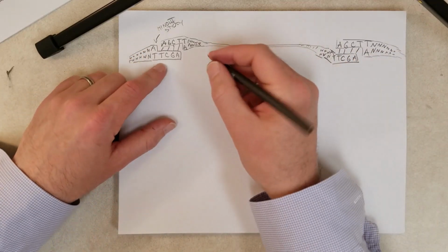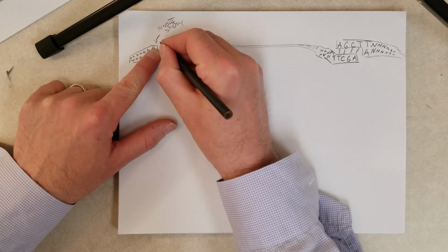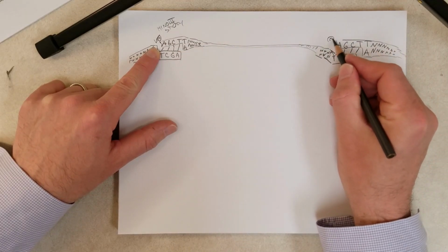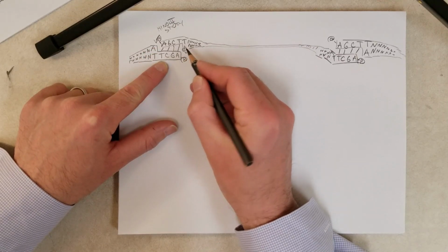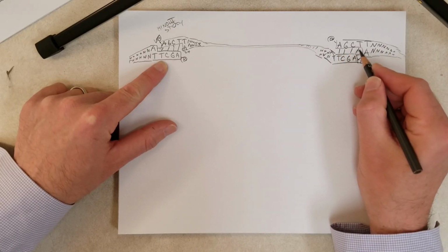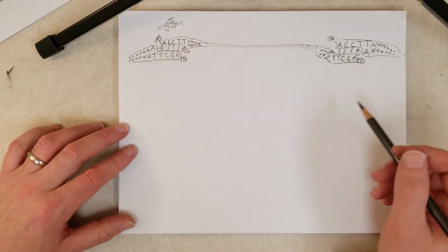Okay. Now, on the 5' ends, there are going to be phosphates. And on the 3' ends, there are going to be hydroxyls, because that's the way HindIII digests DNA. Okay, so now we're ready to add ligase.